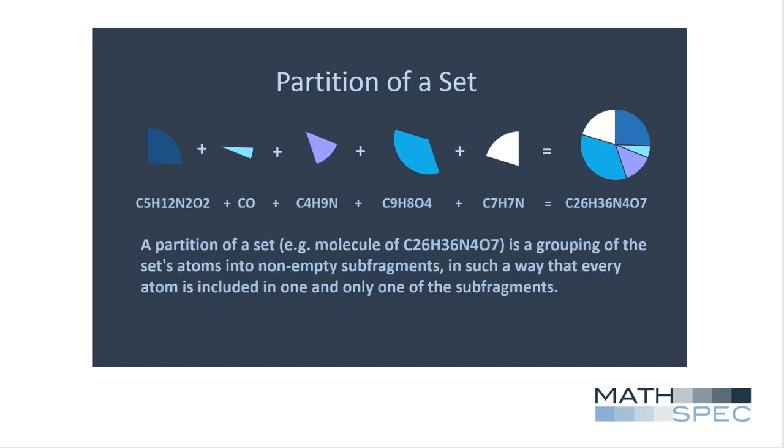Possible molecular formulas of the whole analyte are obtained based on the isotope pattern and the accurate mass of the precursor ion. The subfragment masses that comprise mathematical partitions are then converted into combinations of atoms in such a way that all atoms that comprise a proposed molecular formula of the whole molecule are allocated into subsets of 3, 4, or 5 groups of atoms.